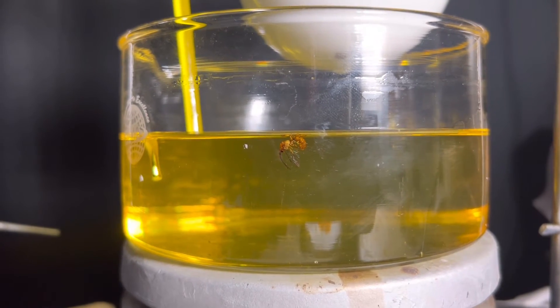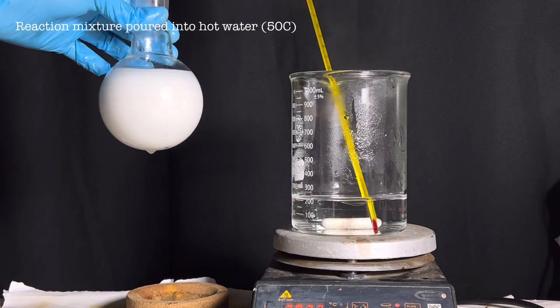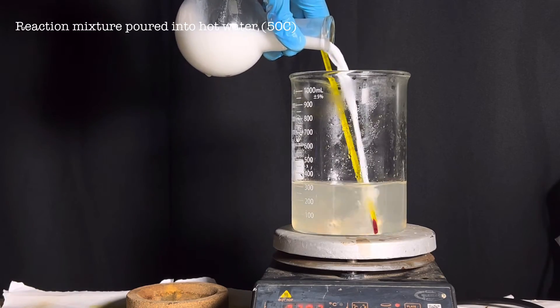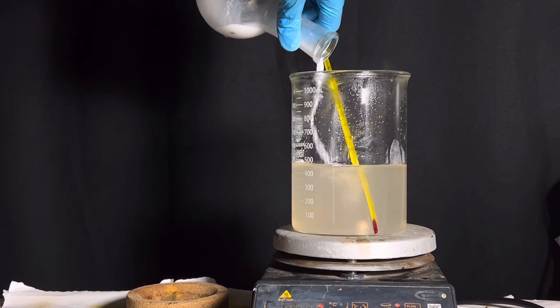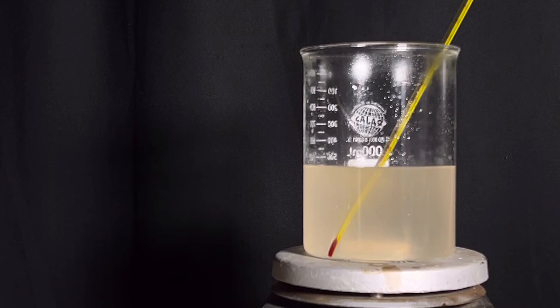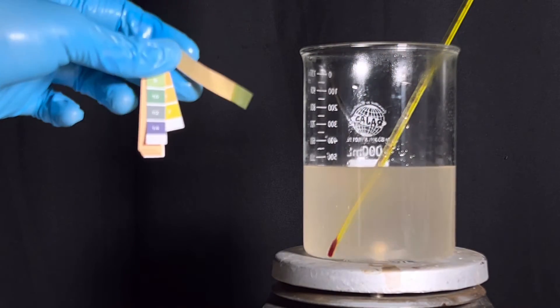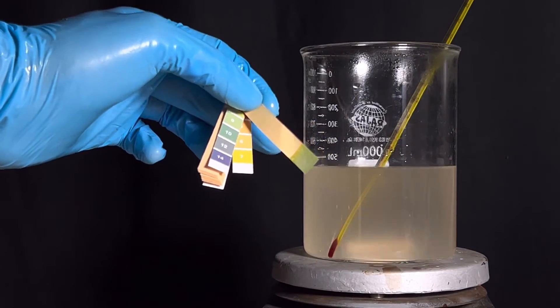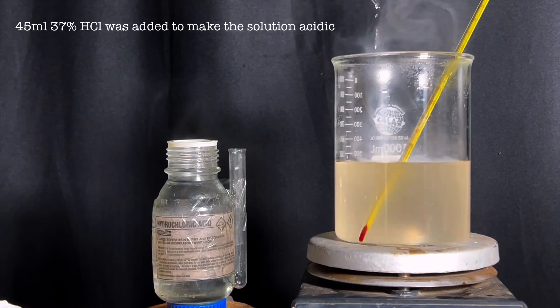Now let us move on. The reaction mixture was added to around 200 ml of hot water at around 50°C, and immediately all the white precipitate dissolved and the solution appeared somewhat clear. I tested the pH using indicator paper and found it to be basic. So I added concentrated 37% hydrochloric acid until the pH became acidic, adding around 45 ml total.